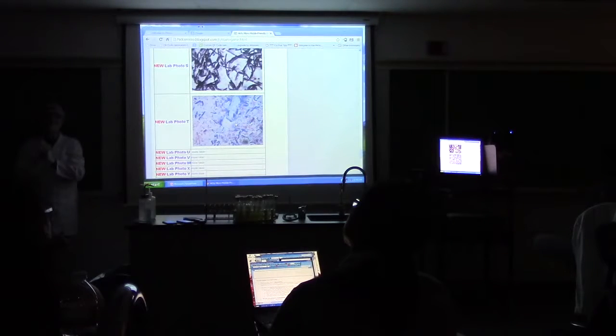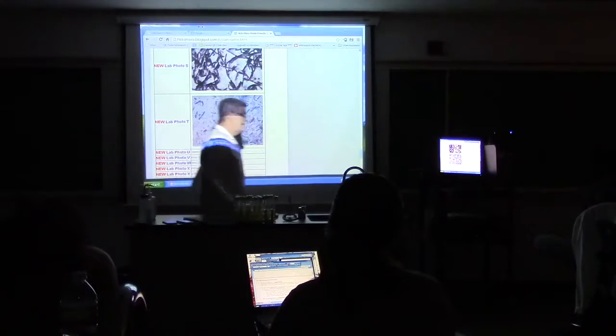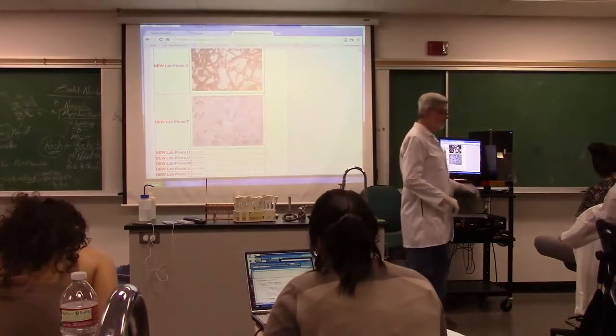Acid fast positive is acid fast. And acid fast negative? Non-acid fast. All right, so flip on all the lights. I'm going to do the demo, and then we're going to do acid fast staining forever.